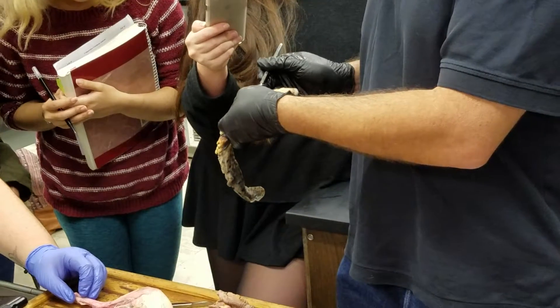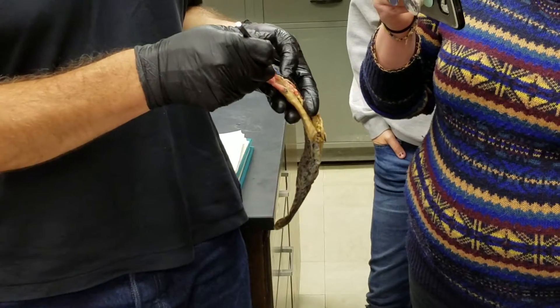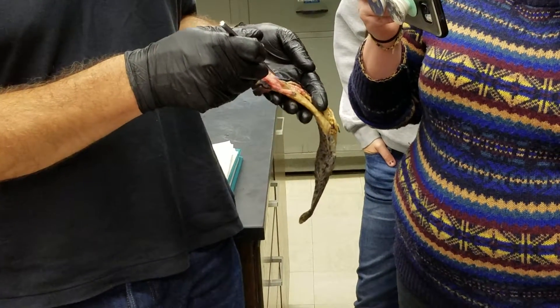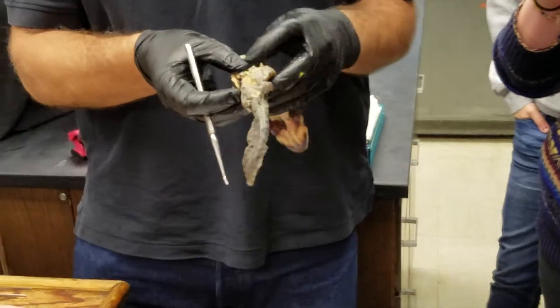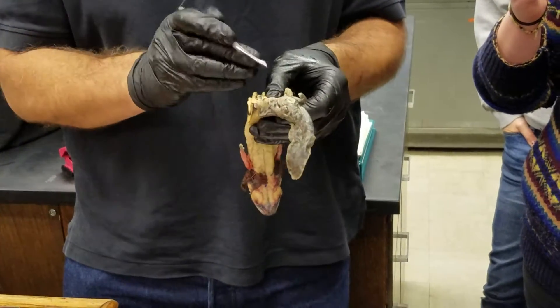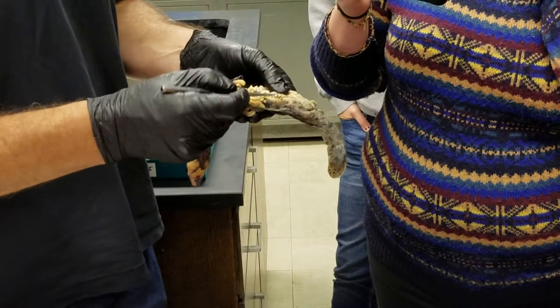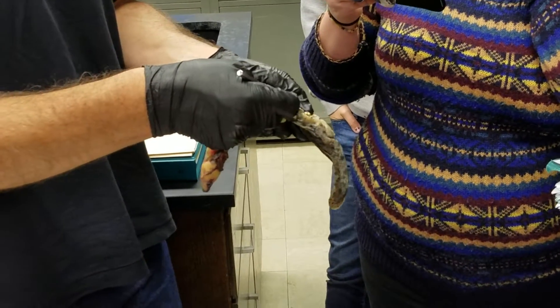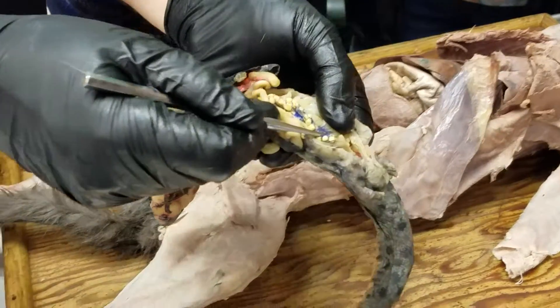That opening into the oviduct is called the osteum. In Necturus, unlike the shark, the osteum is bilateral, so each oviduct has its own osteum. In the female, the kidneys are found here medial to the oviduct. It's a little harder to see than in the male because the oviducts are so big, but that's the kidney there.